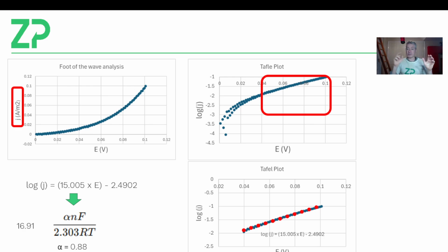So I've got 30% more current, I would argue, in my cyclic voltammetry data that's actually coming from the charging current, because we're scanning quite fast. I'm scanning like 100 millivolts per second. I do that because I'm not that interested in foot of wave analysis, but I realize that when people are doing corrosion studies and battery studies, they're scanning a lot slower than that. So that's why I'm getting more than expected.